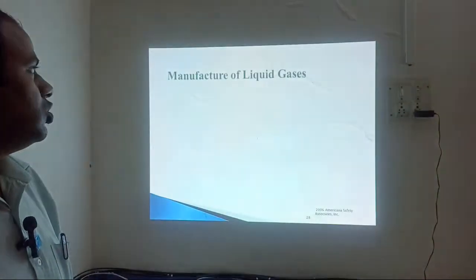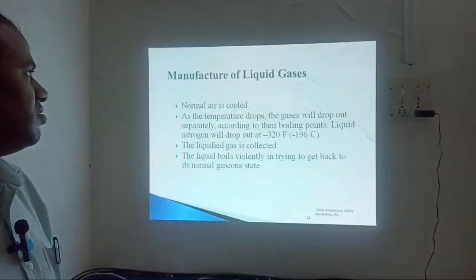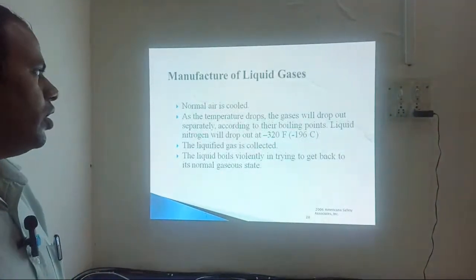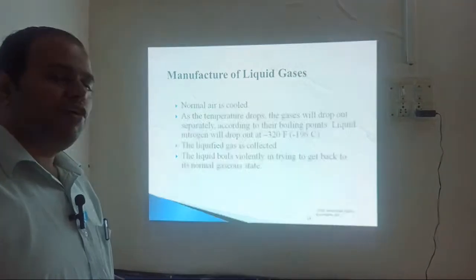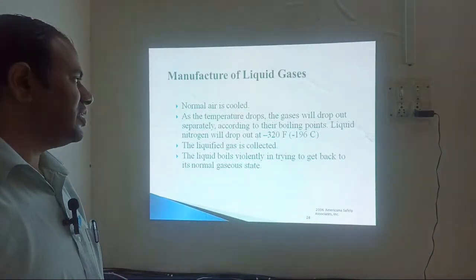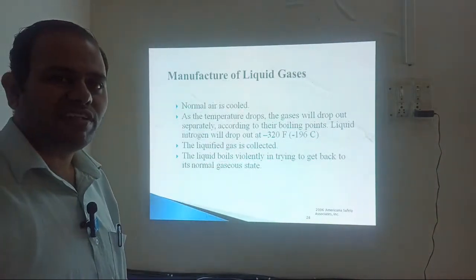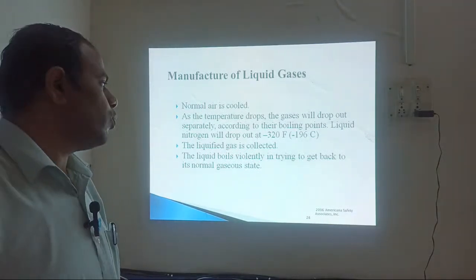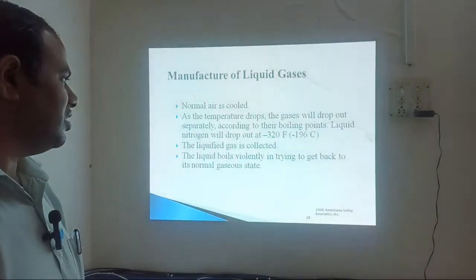So let's see the manufacture of liquid gases. Normal air is compressed and cooled, and as the temperature drops, different gases liquefy. Exactly at minus 196 degrees Celsius, the nitrogen present in air liquefies, and then this is collected separately.